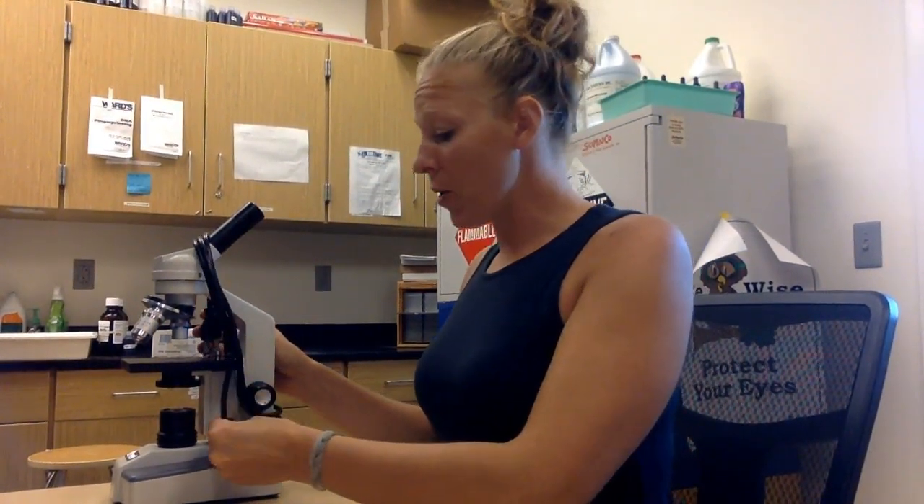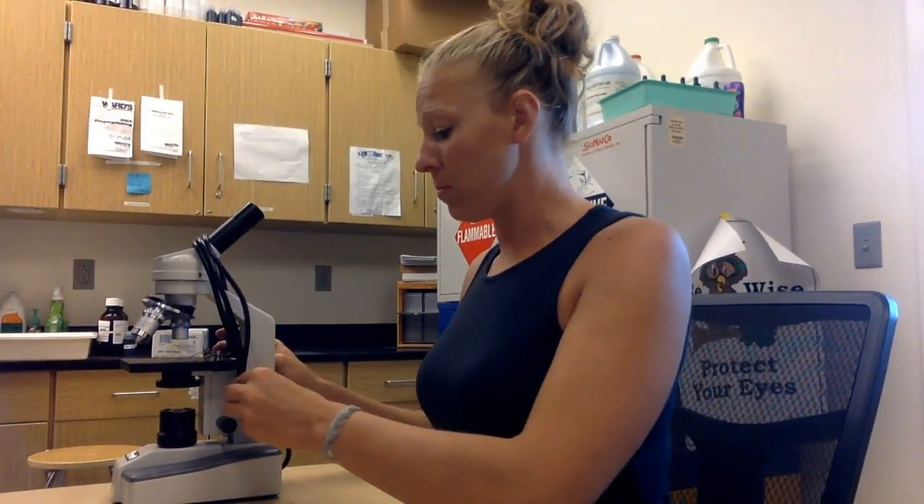Turn it off, wrap up the cord, and put it away where it belongs. If you're at the A table it goes in the A cupboard; if you're at the B table it goes in the B cupboard. Whoever is in charge of microscopes is going to keep a good eye on that. I think that is everything.